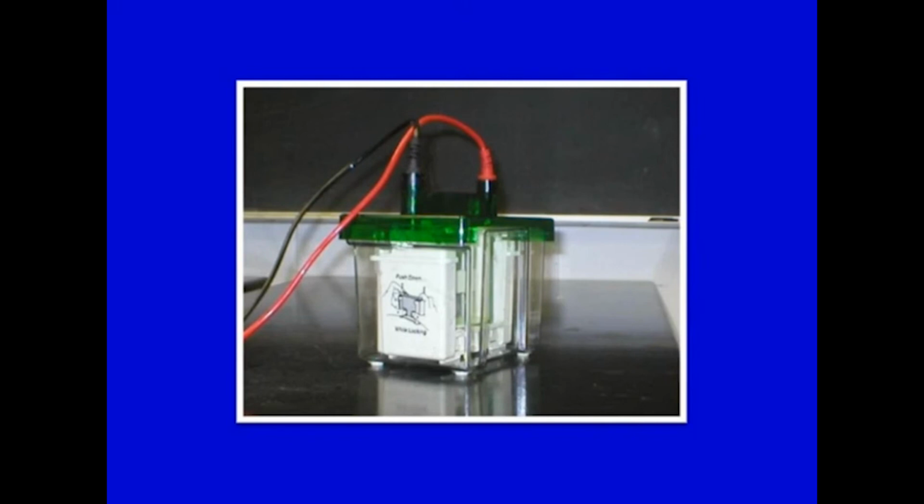The gel apparatus is kept in here, and as you switch on the electric current, protein migration will take place and separation will take place. After the protein has been run, you can remove the gel plates from here. Gel plates could be separated and the gel could be put in a staining solution, like a solution containing Coomassie or any other dye, and they could be visualized.